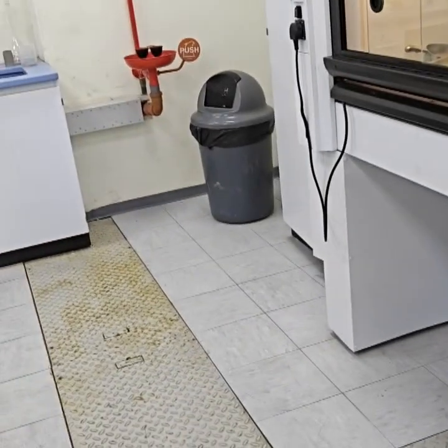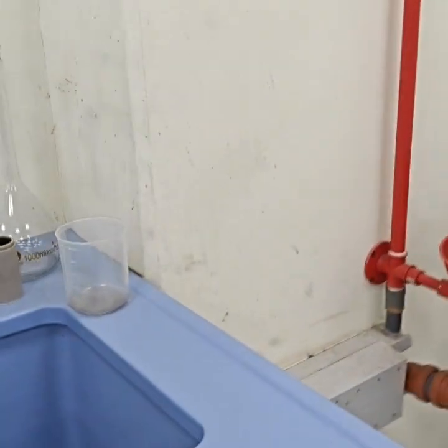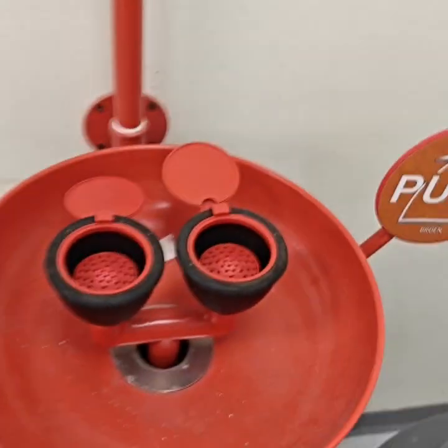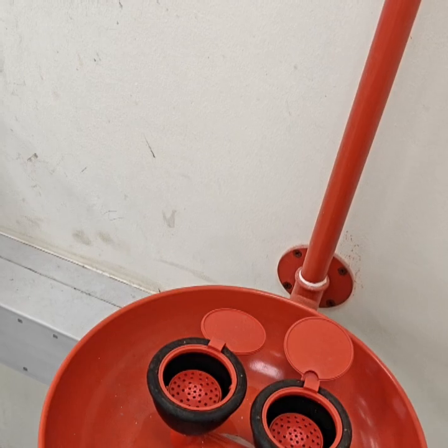Also, there must be a proper eye wash in case you are exposed to chemicals. So here we have the eye wash. You must ensure that it is working properly. Here also, this is the tap one.